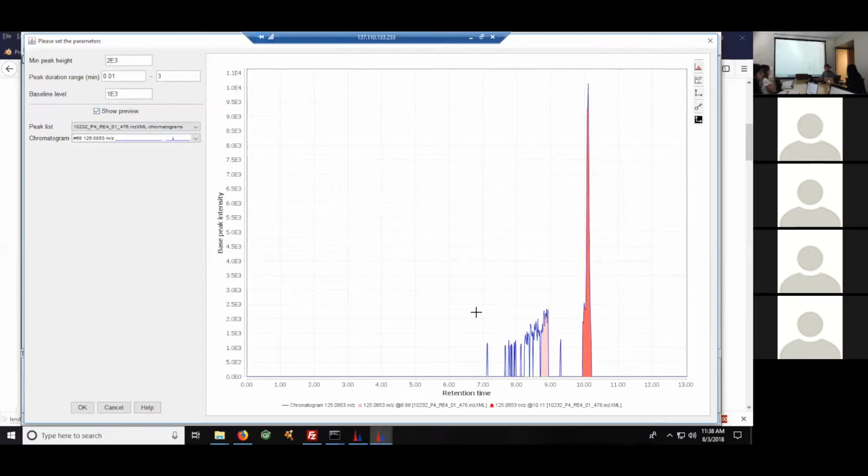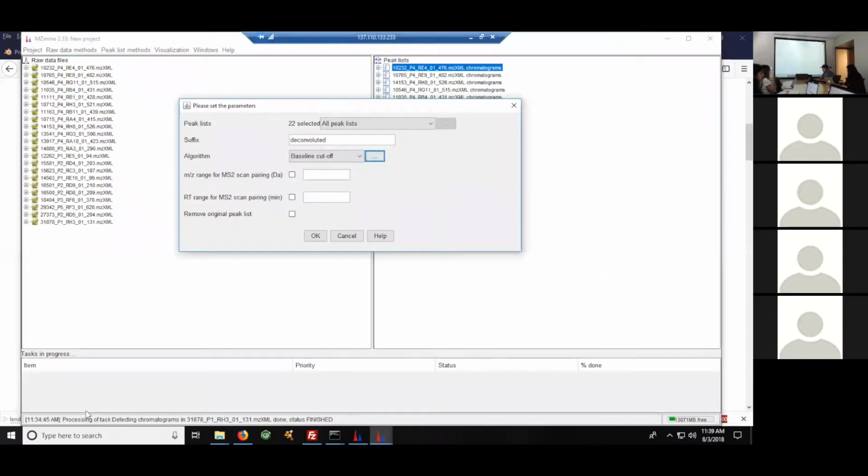And I think when you do feature finding of thousands of features, it's really hard to set this perfect for everything. So it's a trade-off all the time. So yeah, I guess the settings look appropriate. So I'll continue from here.